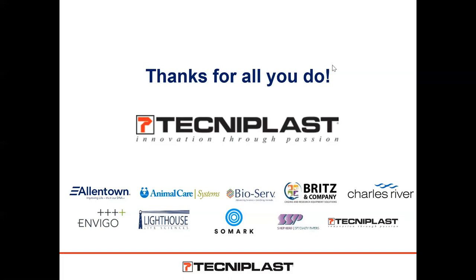Honestly, for some experiments that we are doing, we are not considering the data for the day of the bedding change, because the activity generated is much stronger. So if you want to contact Mike, we can open a discussion, and we are more than welcome to support you. Yeah, and let me just add to that real quickly, Guido.